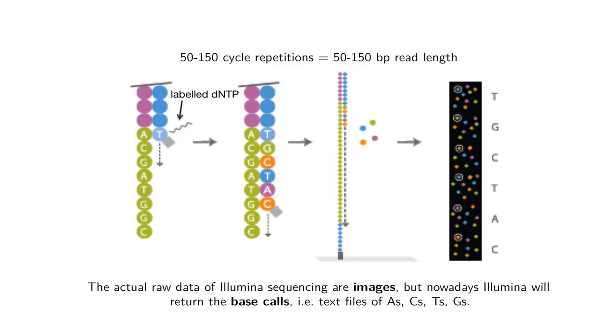So here's another representation of the same thing, where we see 1 molecule that's being extended over several nucleotides. We're showing one at the end with a fluorescent nucleotide on it. You can follow through what's on the right-hand side, which is an image of that region of the flow cell where the image has been captured over the 6 cycles shown, and you can see which spot this corresponds to according to the color of the spot at that cycle.